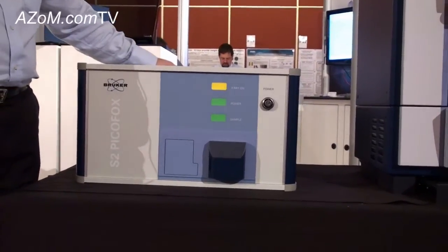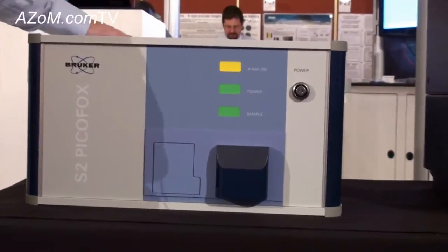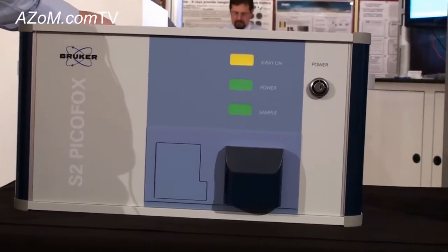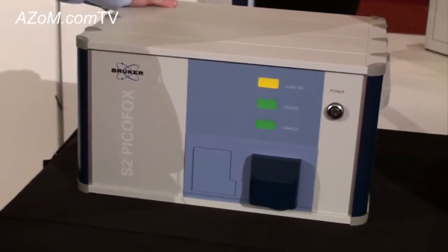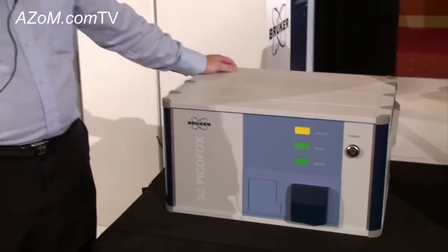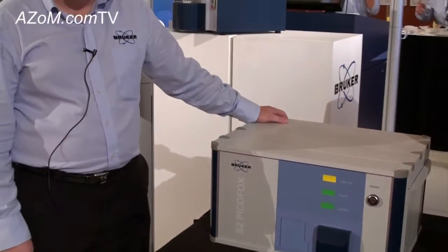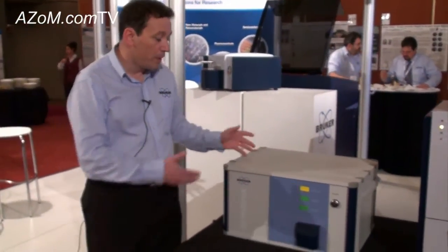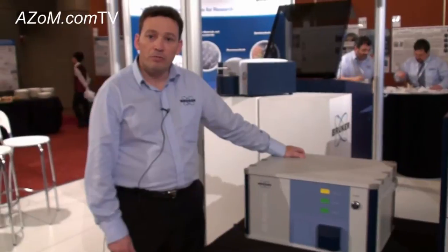Unlike conventional x-ray fluorescence, this has the capability to measure quite low levels. We're talking parts per billion, or even PPT in cases with clean water samples. It has the advantage of minimal sample preparation and portability, so it can be used for environmental monitoring on-site.